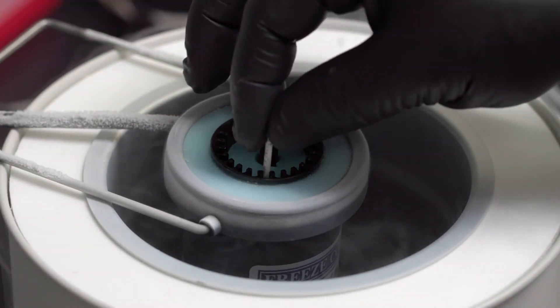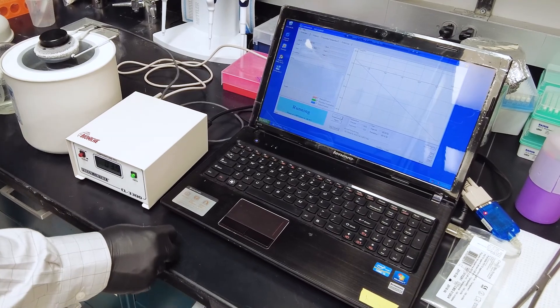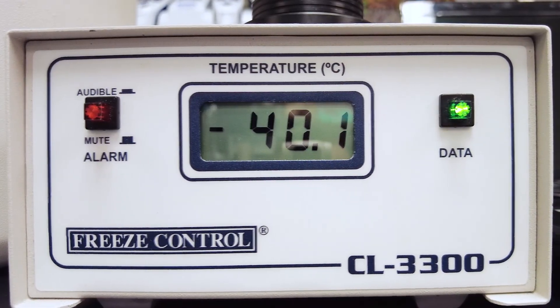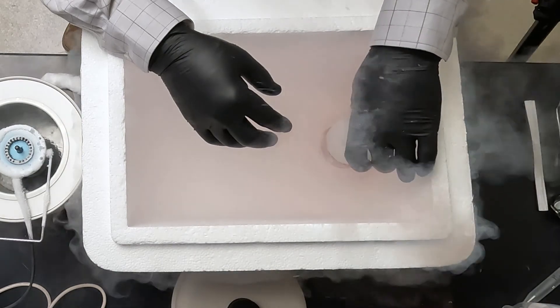Once all the straws are loaded, the freezing program is started. We freeze at a rate of 3 degrees per minute from 4 degrees Celsius to negative 40 Celsius. While the straws are freezing, we prepare a liquid nitrogen bath and prep goblets for storing the straws.